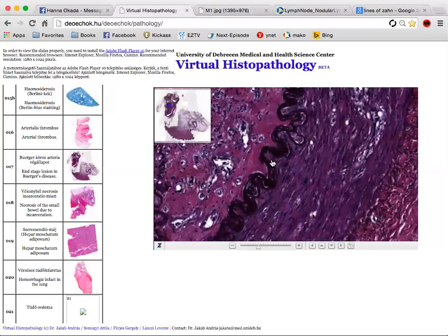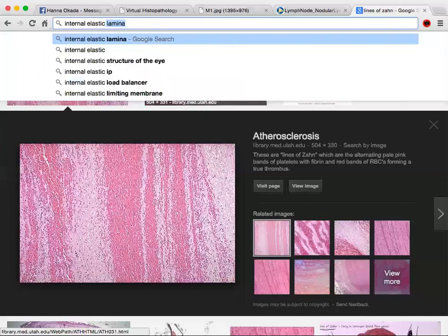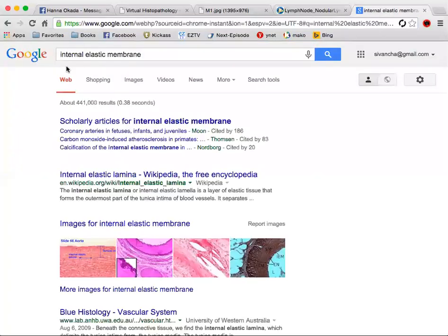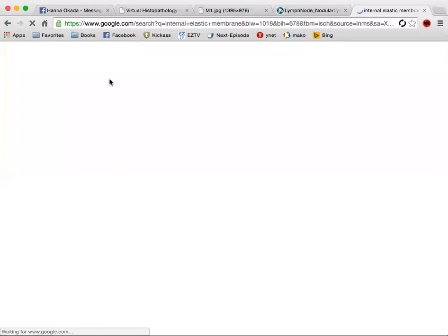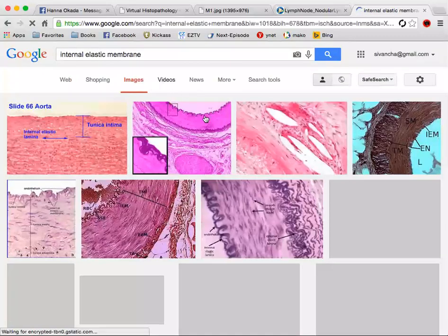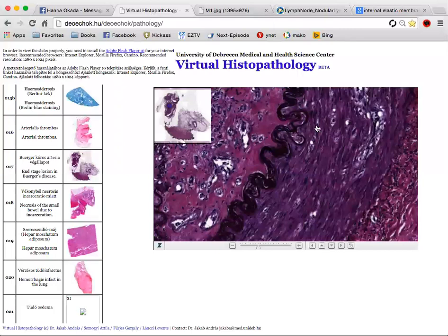Why, like how to say, up and down like this? Because of the shrinking. I mean, I'm gonna show you an internal... Okay, I'm gonna show you a normal photo of it. Okay, so you see, it is kind of wavy, but it's even more so here.